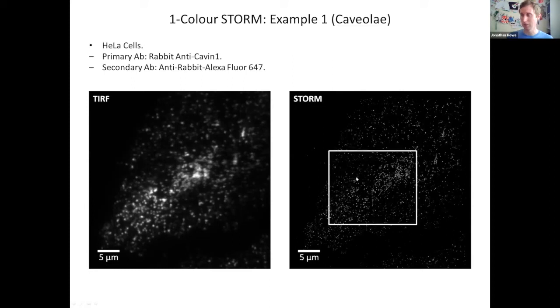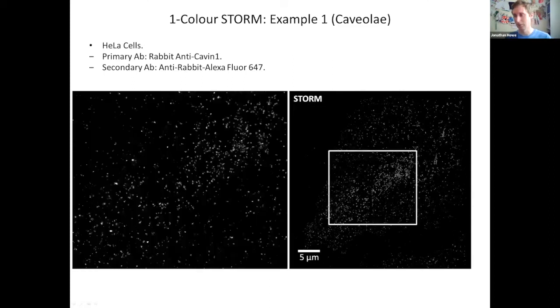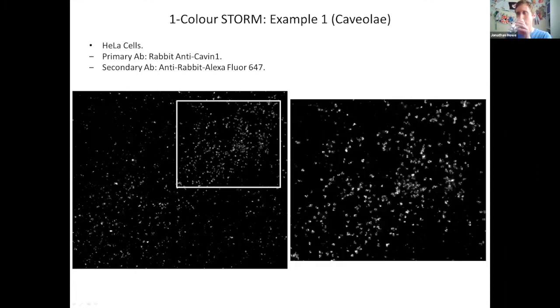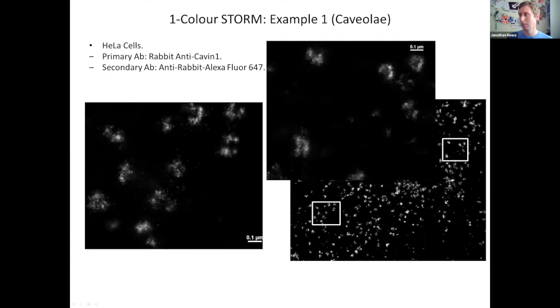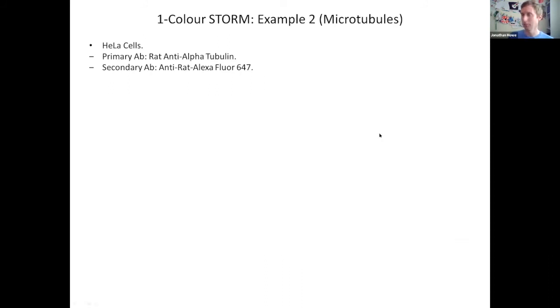And what I can actually do is blow up this image over and over again until we can see individual caveolae, and they're not blobs any longer. They're sort of cup shapes, or maybe even fully enclosed internalized vesicles. So this tells us that the resolution must be at least about 50 nanometers. So yeah, this is clearly a very powerful technique.